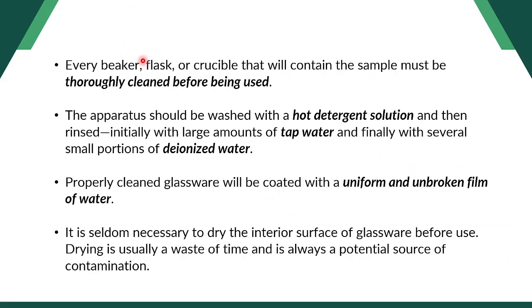Now, every beaker, flask, or crucible that will contain the sample must be thoroughly cleaned before being used. In other words, tanang mga equipments, laboratory apparatus nga atong gamiton in doing a particular laboratory work, dapat hinlo gyud sila. Properly clean, no? To make sure nga wala gyud masagol, para dili mahaluan og mga unwanted substances. Dapat limpyo gyud na sila.